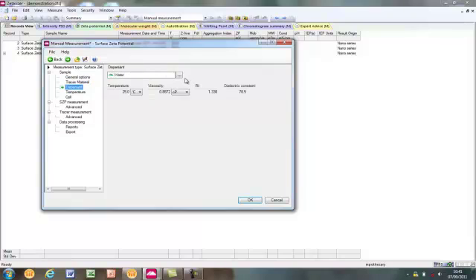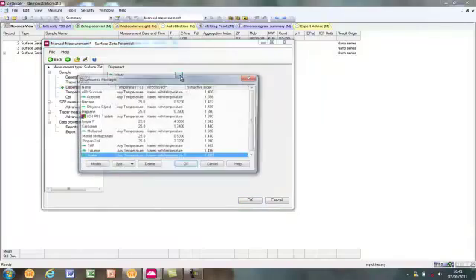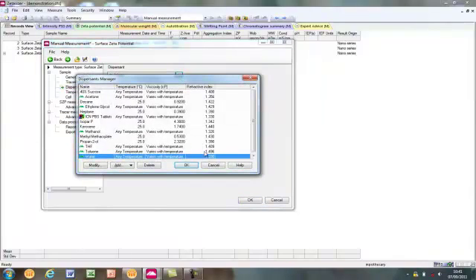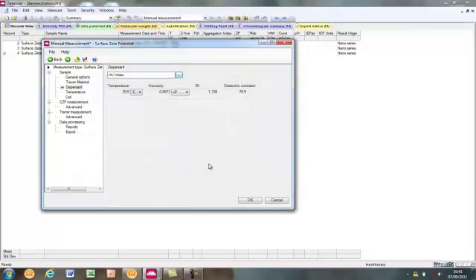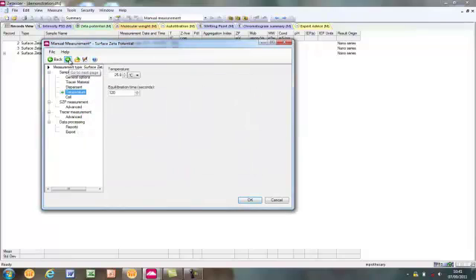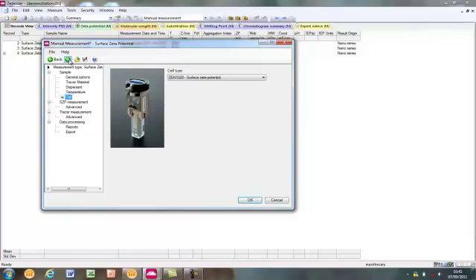If the medium to be used is not available, the solvent builder can be used to create a buffer containing the appropriate additives, or a simple solvent can be input into the solvent database. The temperature is then set. It is recommended to give the sample a 120 second equilibration time. The surface zeta potential cell should already be selected as the cell type.